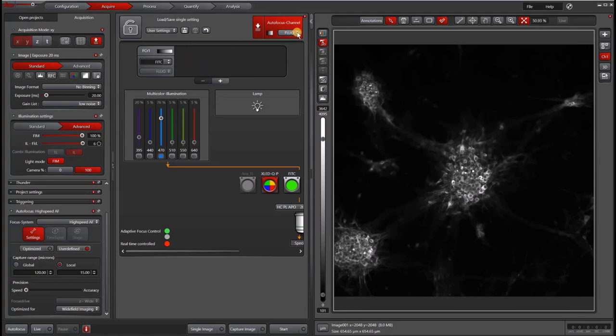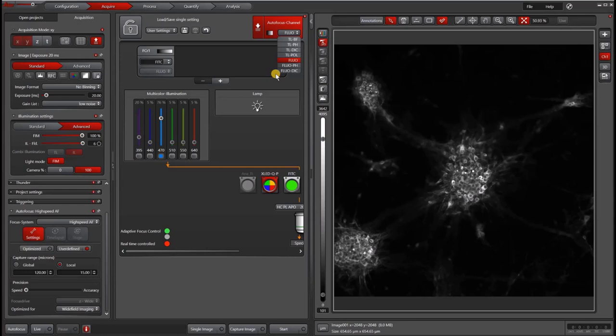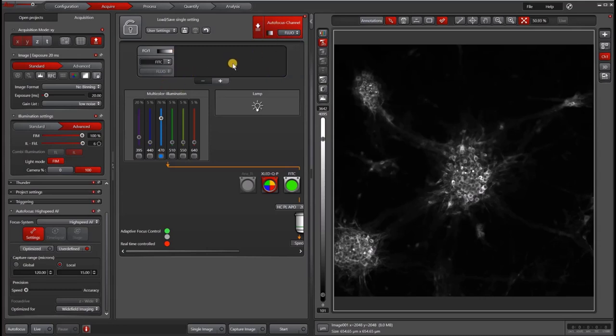Under autofocus, I have the option of choosing all of my different contrast methods. So even if in the end you are using fluorescence for acquisition, you might want to choose transmitted light, either bright field or phase method to do the focusing because it's usually faster and less photo bleaching. But in this case, I've set it up exactly the same as my acquisition, which is in the FITSI channel.